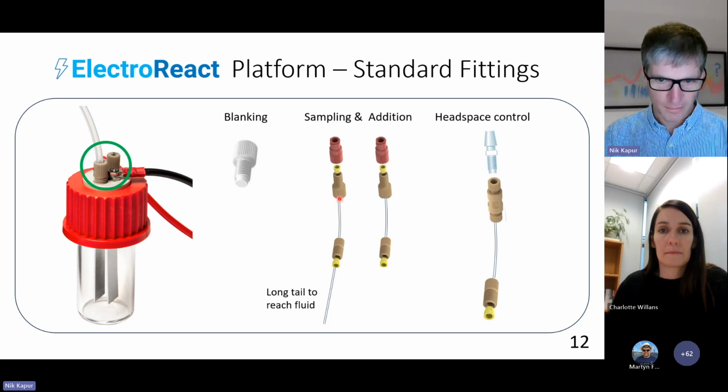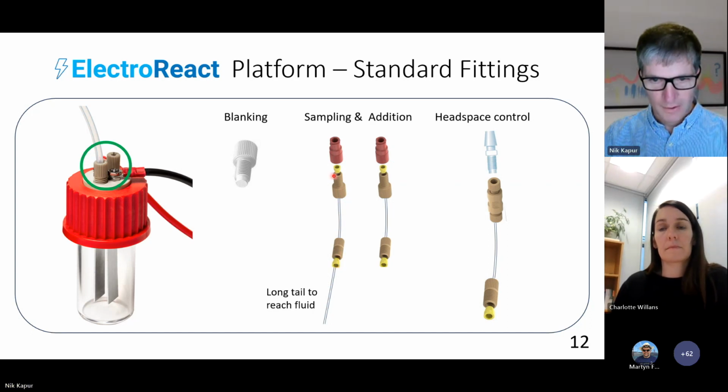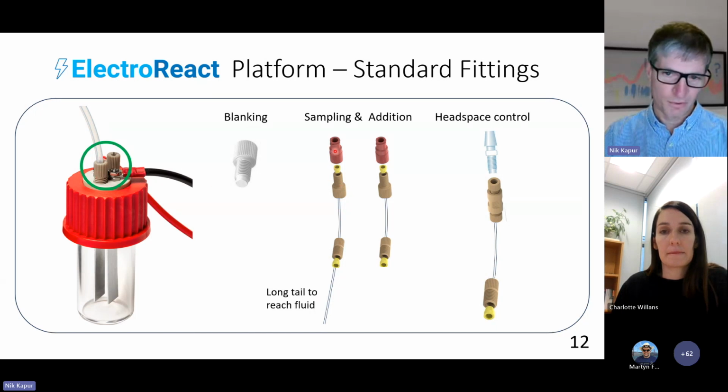So here you would take a piece of tubing, that's what's represented by these blue lines, and you would configure two 1/4-28 inch adapters onto those. This lower one will get screwed into the bottle, and this other one here has been screwed into a standard Luer adapter for a syringe.